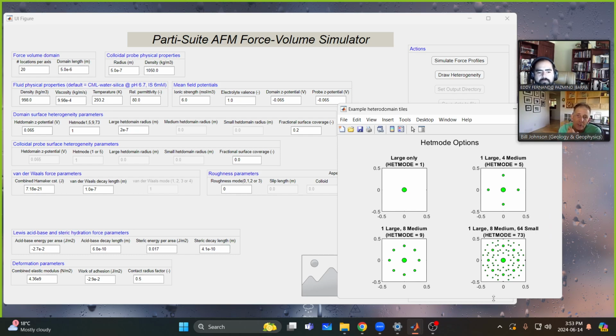And these patterns achieve that. So it's a useful model if you're trying to explain attachment of multiple sizes, these het modes other than one. But that actually is more relevant in the transport model. So this one kind of shows what they look like, but it's actually most relevant in the transport model.